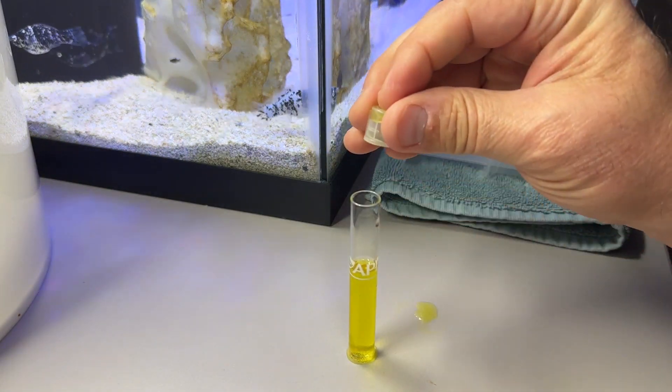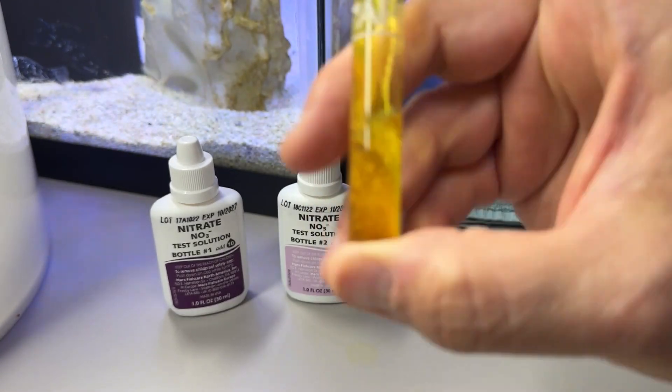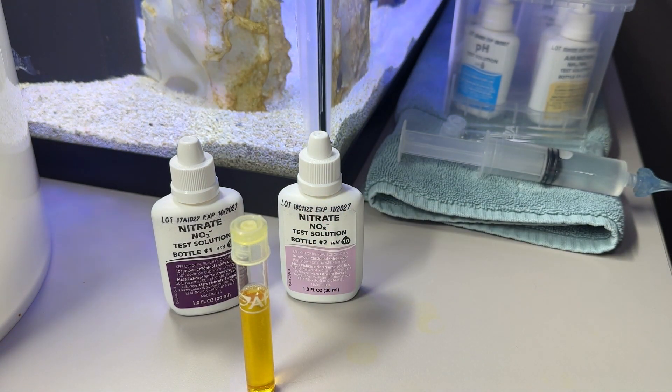Now, very importantly, we're going to instantly cap the test tube and shake vigorously for one minute. I've shaken it for exactly one minute, and now we're going to set our timer for five minutes. Hey Siri, set timer five minutes. Then we'll come back and take a look at the color.